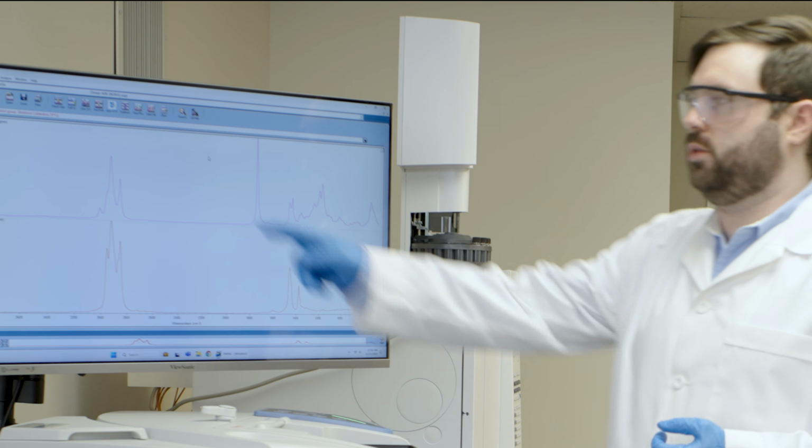So this is very helpful to help identify and to track the changes over time of these various fuel samples, but it's also very helpful for finding unknowns. If we find a sample in the field, we get a sample and we really don't know what this kind of sludgy material is, we can put it on this device and get a reading of it. And this device basically has a library built into it.